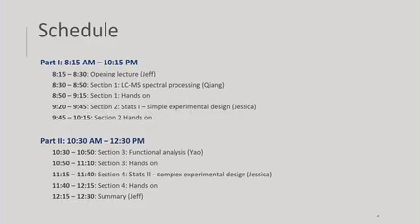And the last part is the latest addition for complex metadata, because metabolomics is now used for a lot of clinical or population studies, and you have a lot of experimental factors in addition to the main one, like control versus disease. So when we're doing data analysis, we need to account for these covariates. How do you upload the data and tell the program, here's my experimental design? What's the best way to analyze them? So this is the last session.